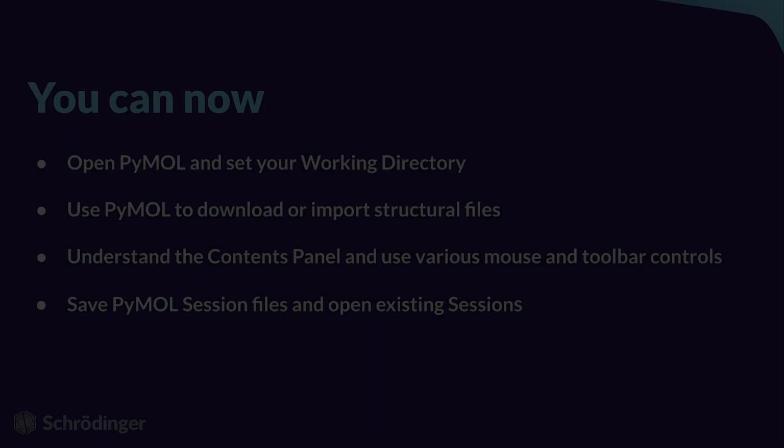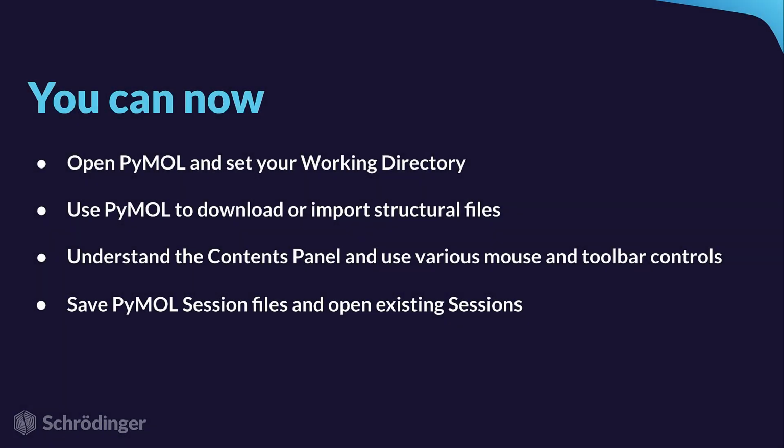That brings us to the end of this tutorial. You can now open PyMOL, set your working directory, use PyMOL to download or import structure files, understand the contents panel and use various mouse and toolbar controls, and save PyMOL session files and open existing sessions.